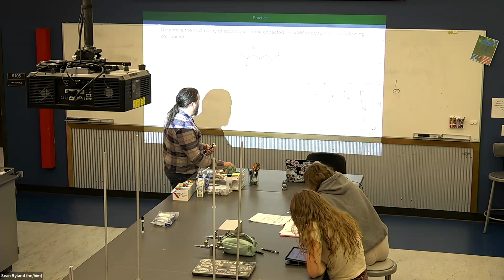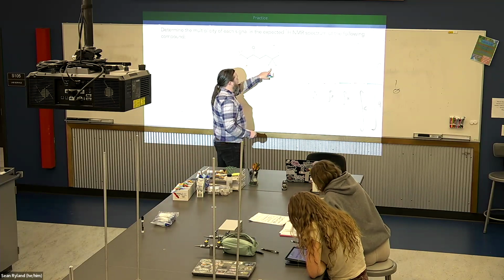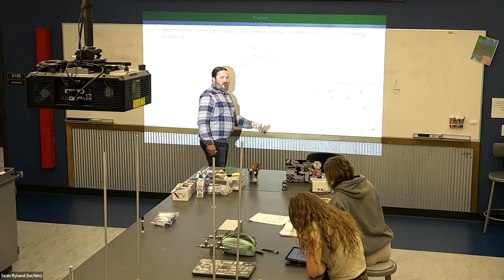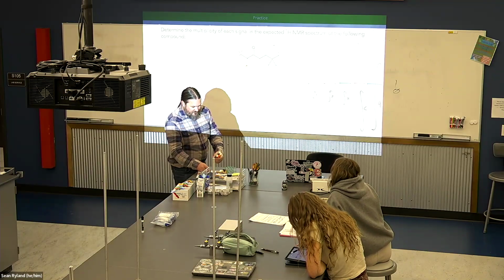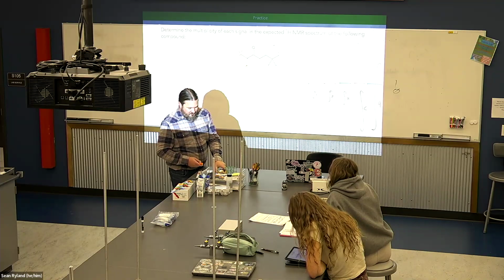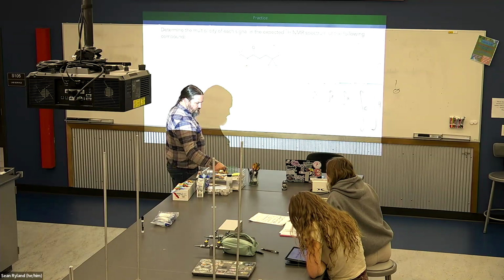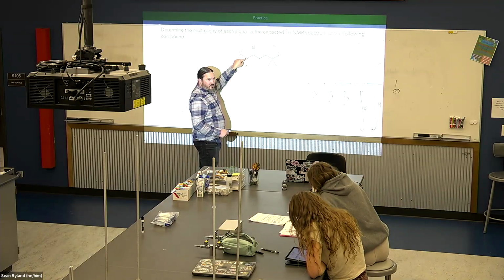And the last piece is the splitting. What do the peaks actually look like? What's the splitting going to look like for, let's do purple. We'll go left to right. It has 6 nearest neighbors.